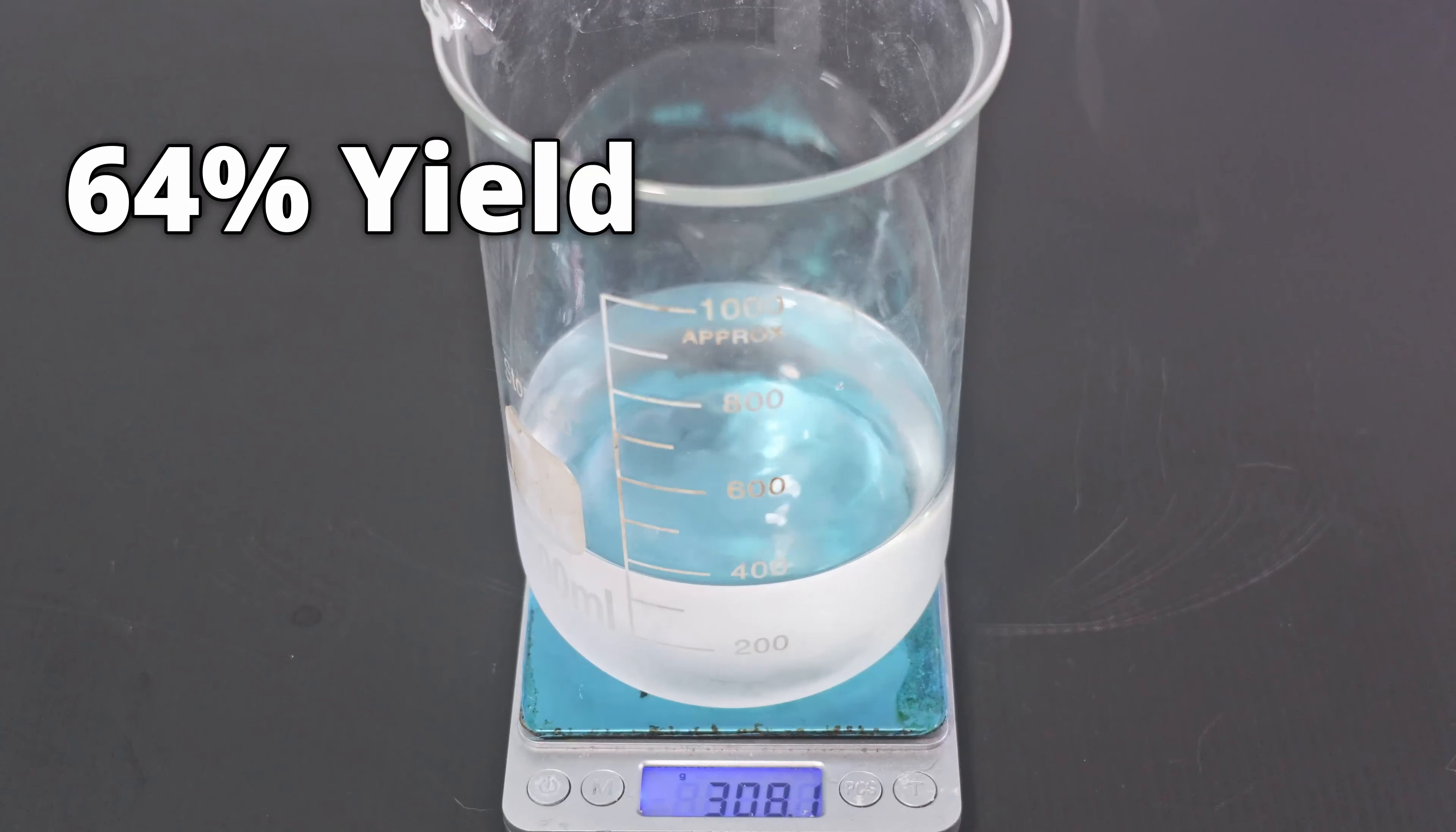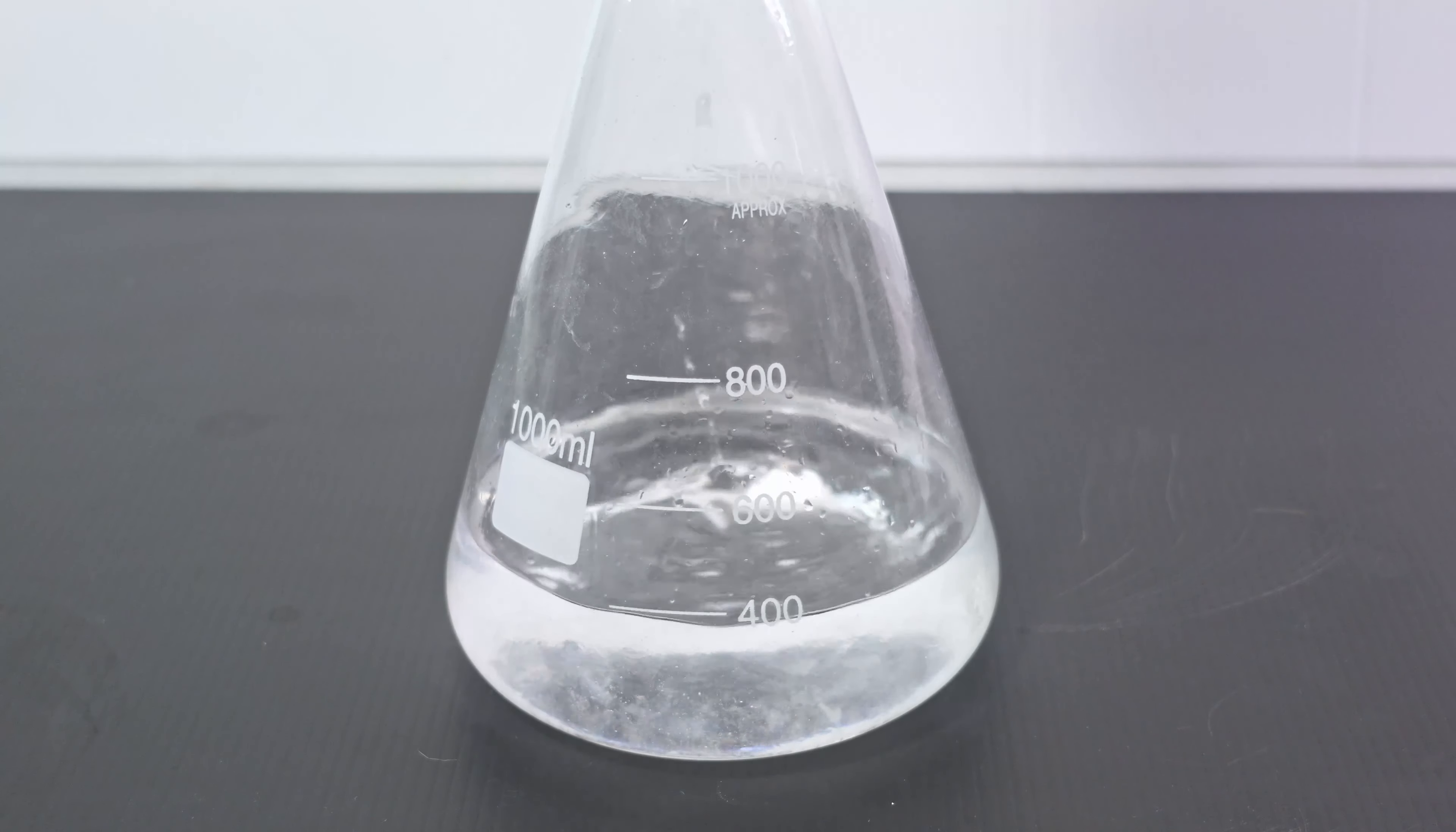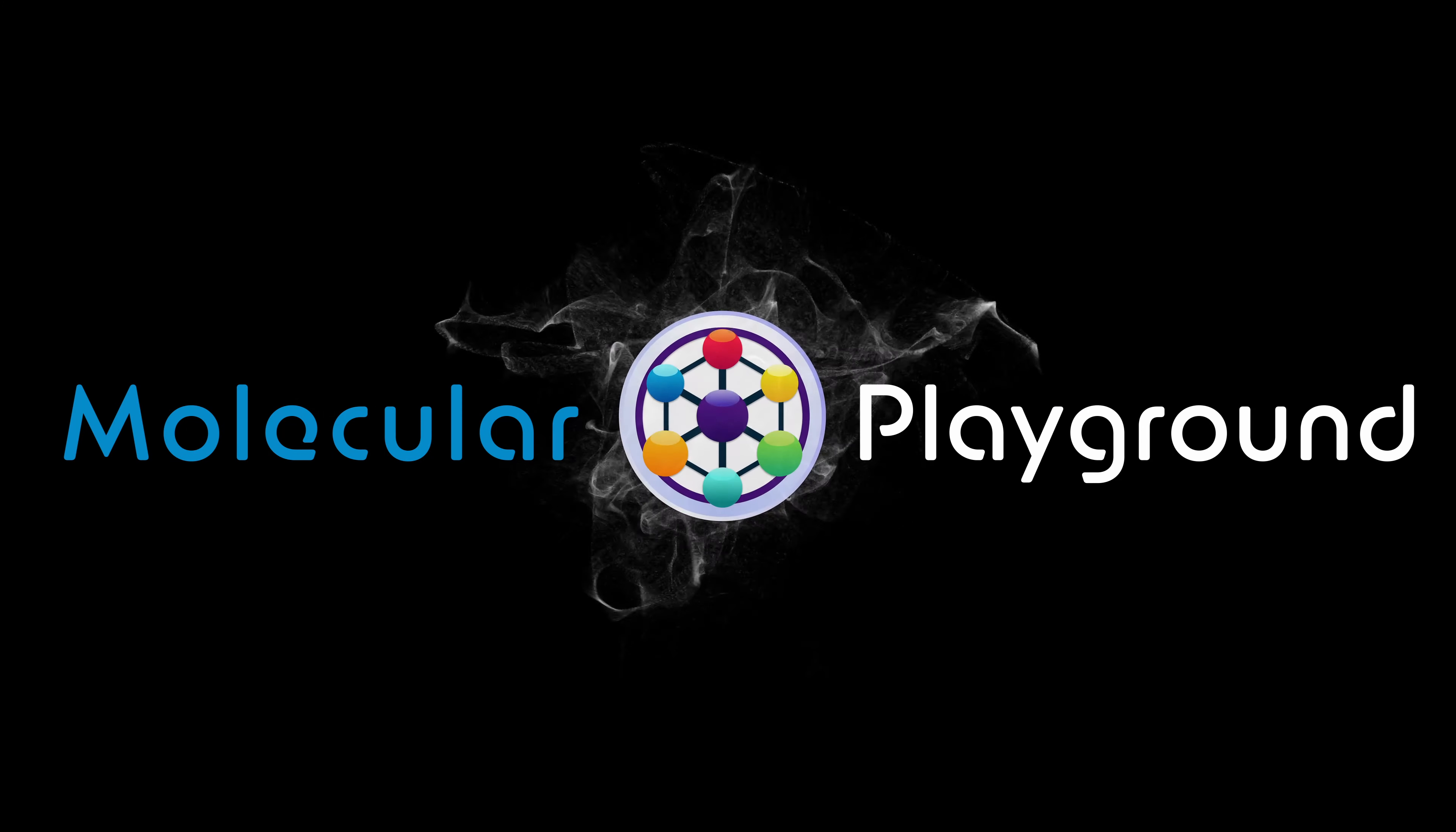This is much better than the yields of similar experimenters, which always seem to hover around 50%. This yield is also on par with many research papers online. I'm going to store my tert-butyl chloride in here for now until I get a more permanent container. Make sure to store it in a freezer to reduce volatility.